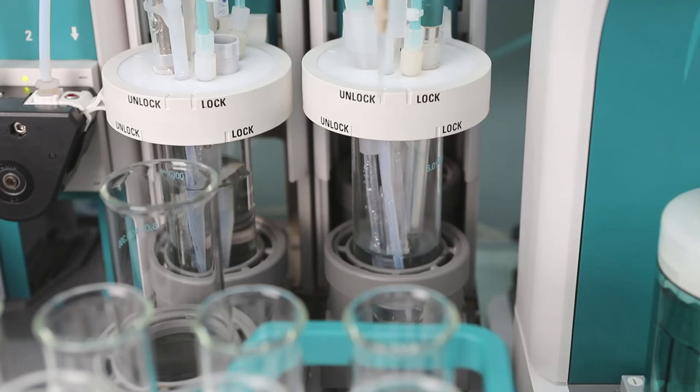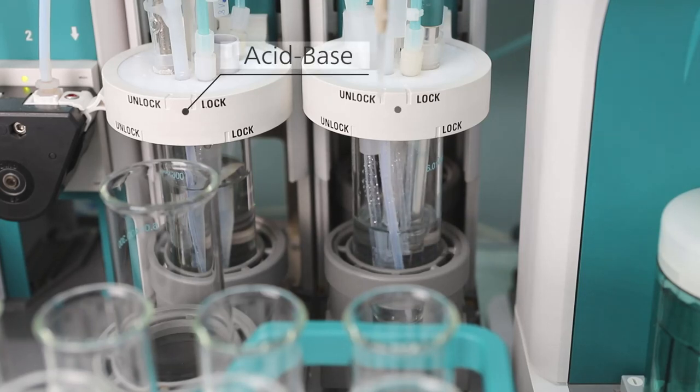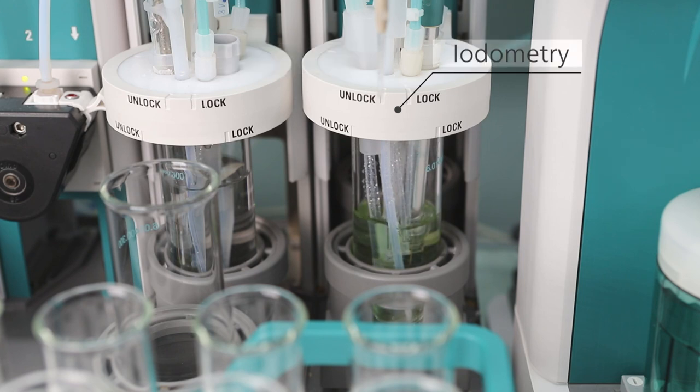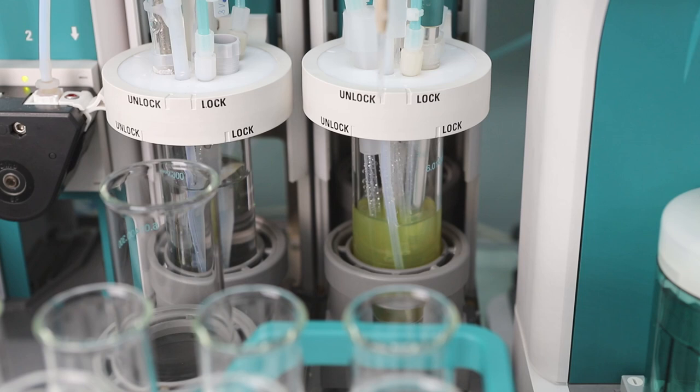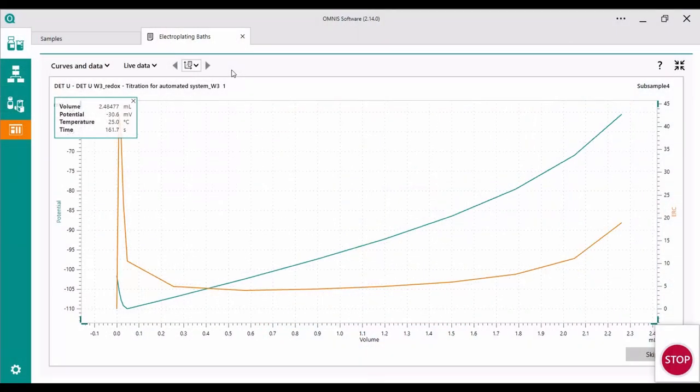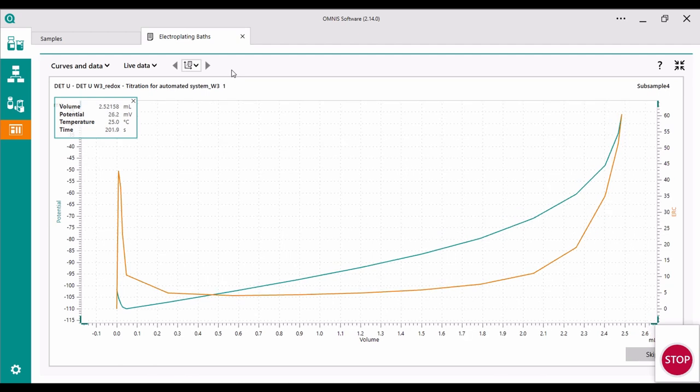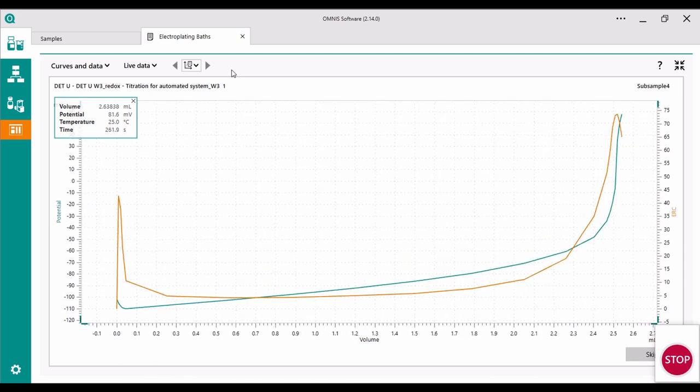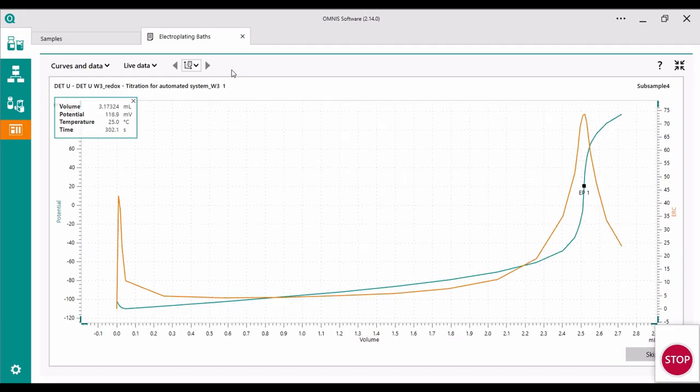The next titration is the iodometric determination of the copper concentration in an acidic copper bath with a platinum titrode. Prior to the determination, two auxiliary solutions are dosed automatically. A mixture of potassium iodide and potassium thiocyanate and sulfuric acid. The forming iodine gets titrated with a 0.1 molar sodium thiosulfate solution.